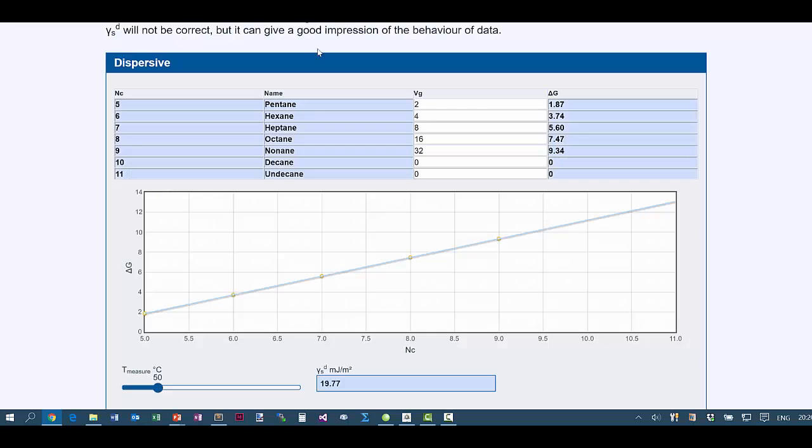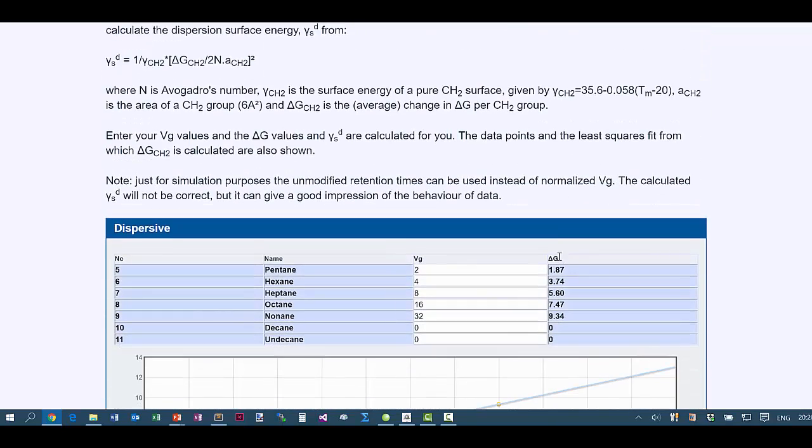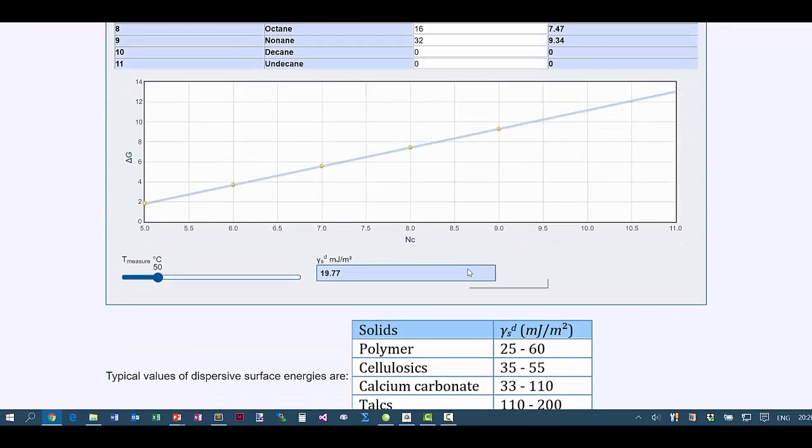We discussed in the first video measuring dispersive energy. You have the peaks from pentane, hexane, heptane, and octane, and from the slope of delta G versus carbon number you can calculate the dispersive free energy.